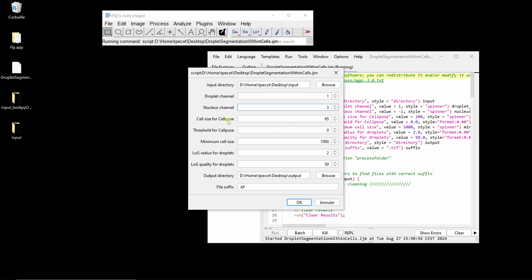Using DAPI might help for the cell segmentation. We use Cellpose here, a very powerful cell segmentation tool. Cellpose was trained to identify cells with input images with one channel with a cytoplasmic membrane marker basically, or with two channels, adding a nucleus marker.